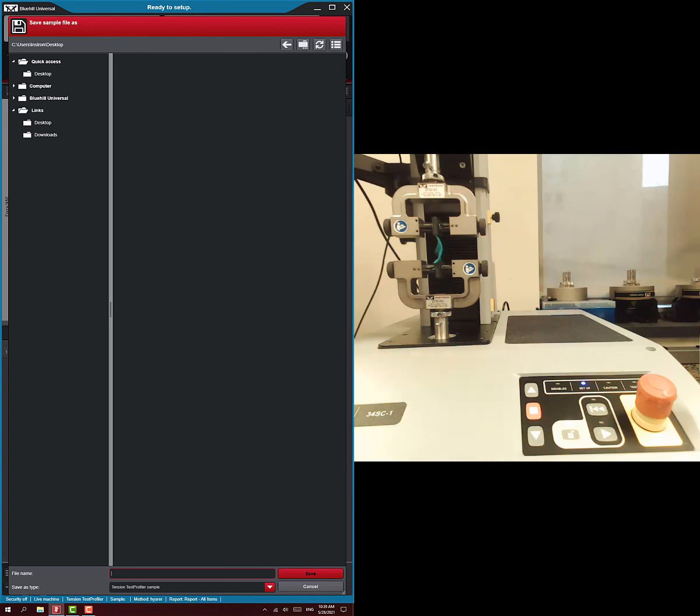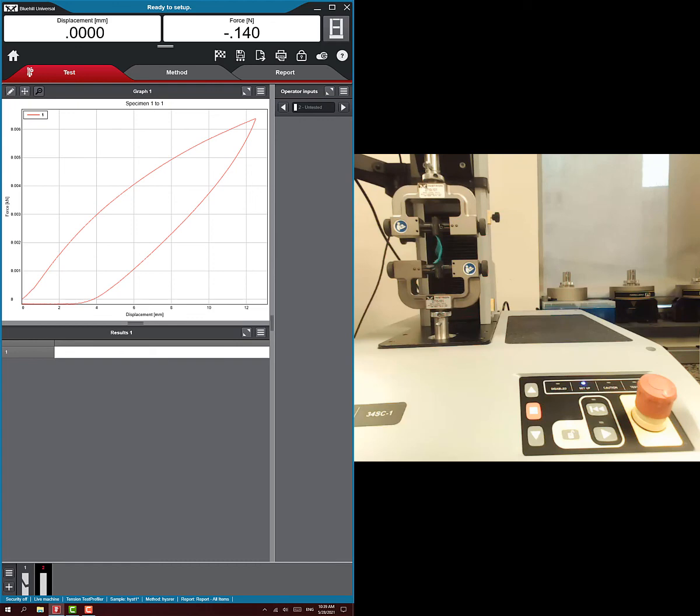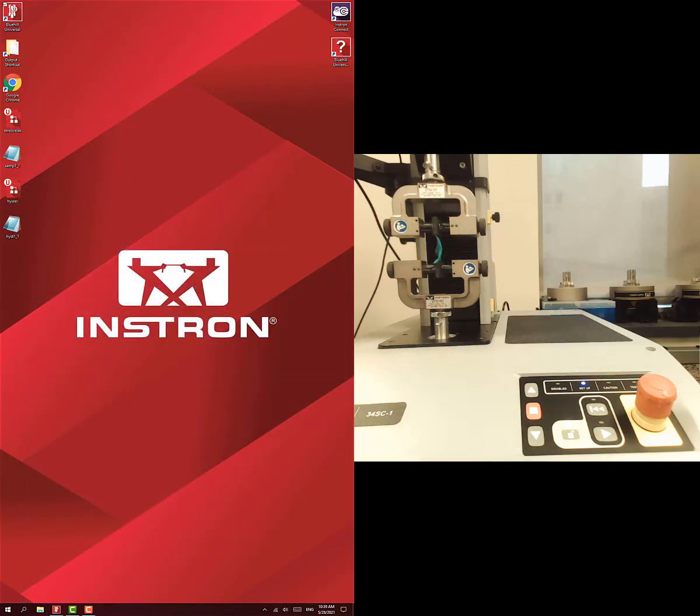And now we're done. It will ask us for the file name to save it as — I'll call it hist1. We're pretty much done. You could go ahead and take out your sample, put in the next sample, and run it. But we're done here, so I'll hit home. We have our data on the desktop where we expect it. Make sure you move that data to Google Drive or someplace where you can access it later, then go ahead and delete all the data because we don't want to clog up the computer with everybody's old data.